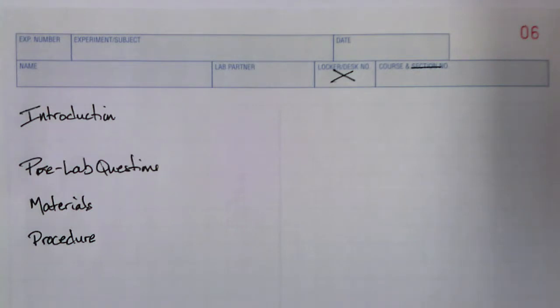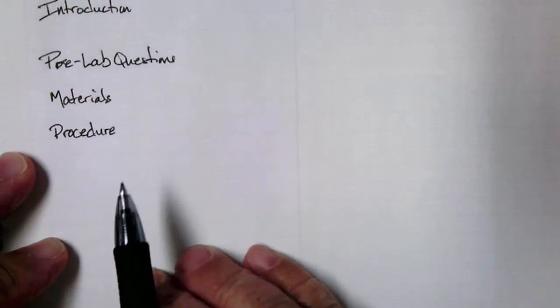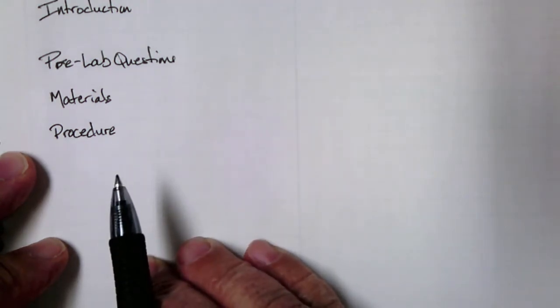And after that, your procedure. You can copy the procedure verbatim from the laboratory handout that I give you, or you can summarize that. You need to be careful with summarizing, though. You want the directions to be clear so that you can follow them. Ideally, you should be following the procedures that you've written here in your lab notebook, not off the lab sheet itself, because this is what you'll have to refer back to. You may lose the lab handout at some point, but you should have this. All of these 4 sections should always be filled out before you enter lab.